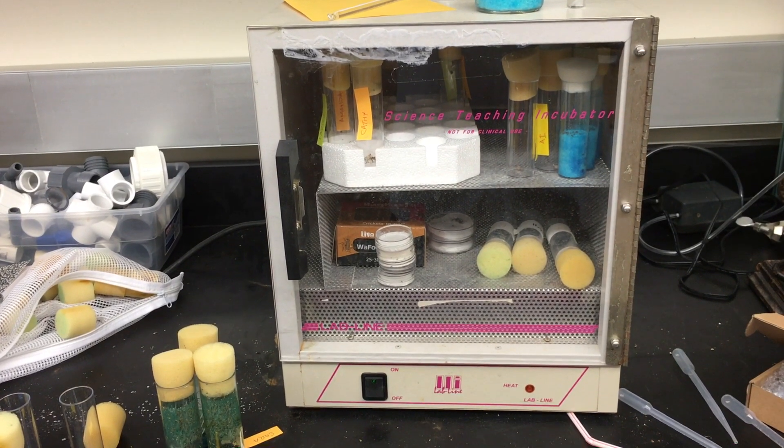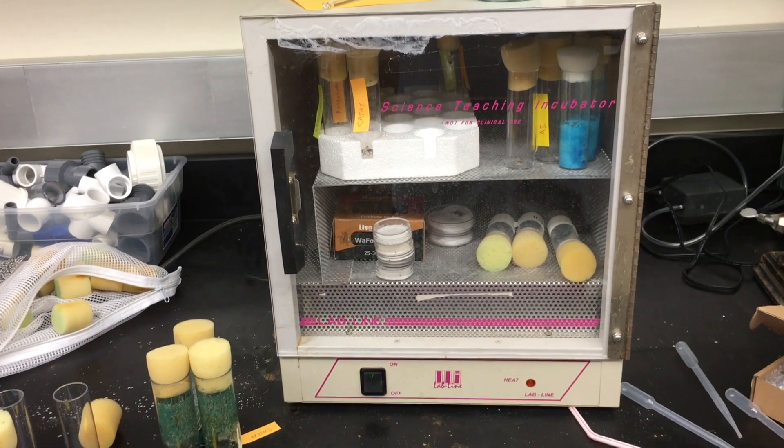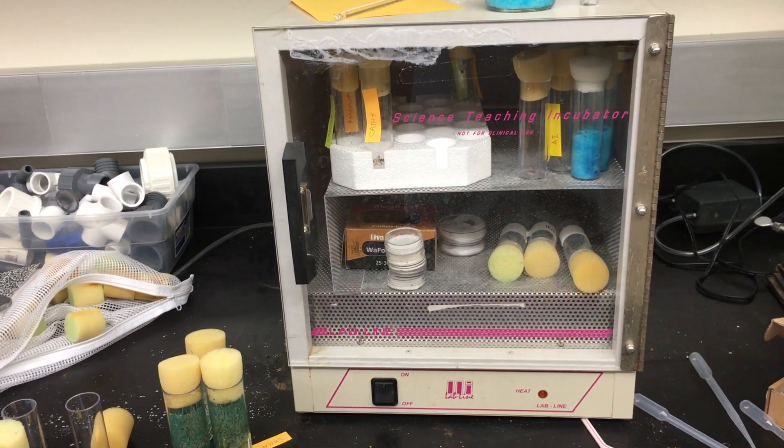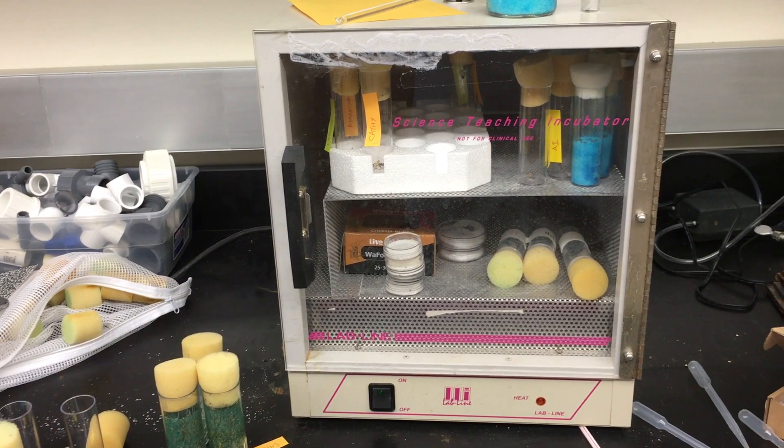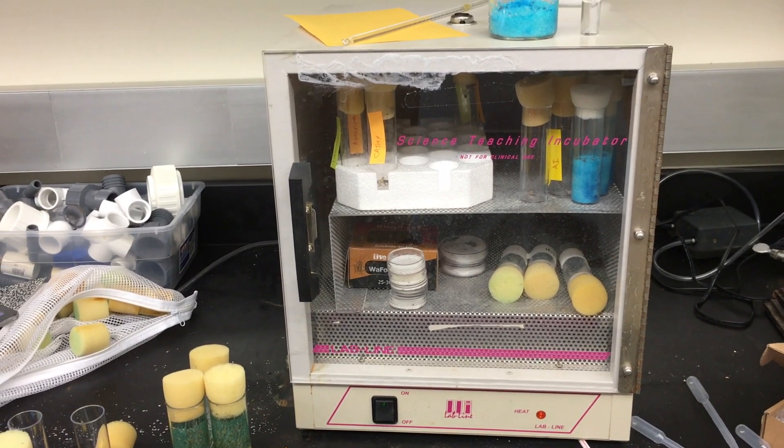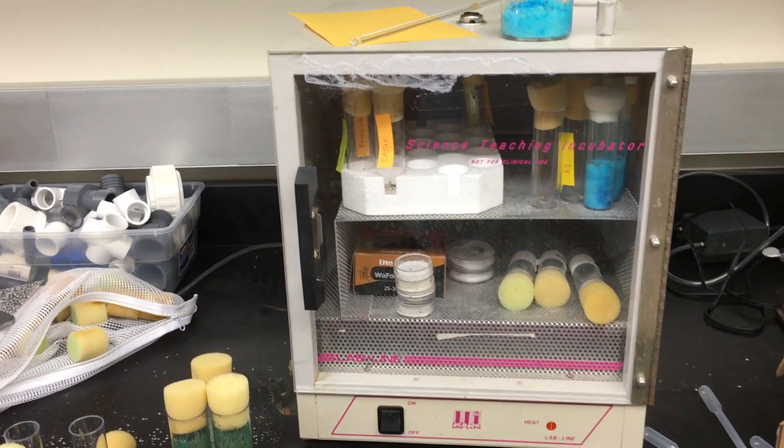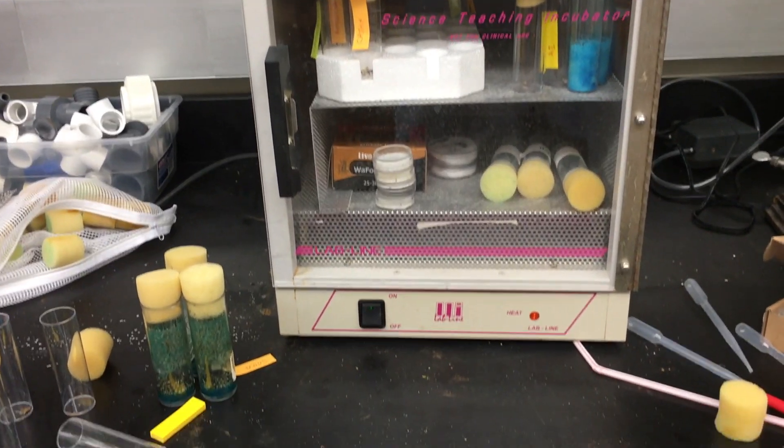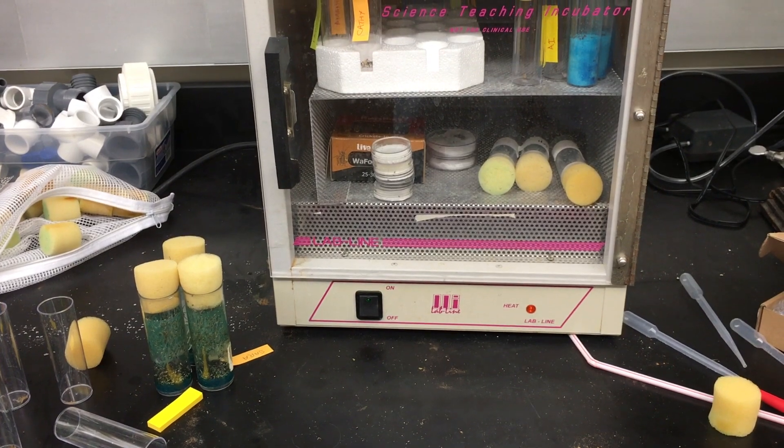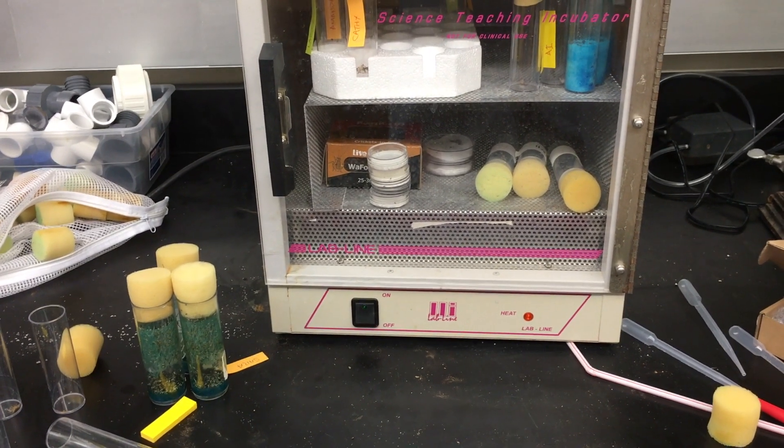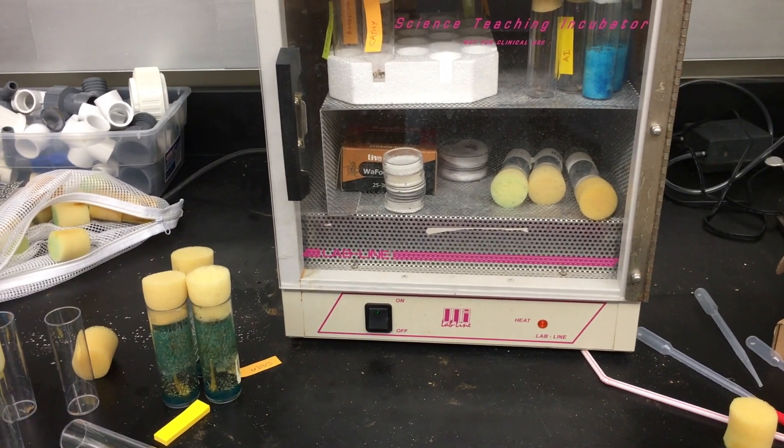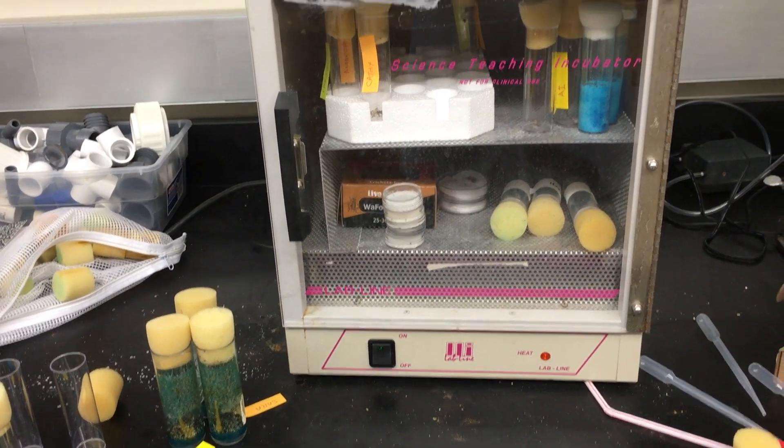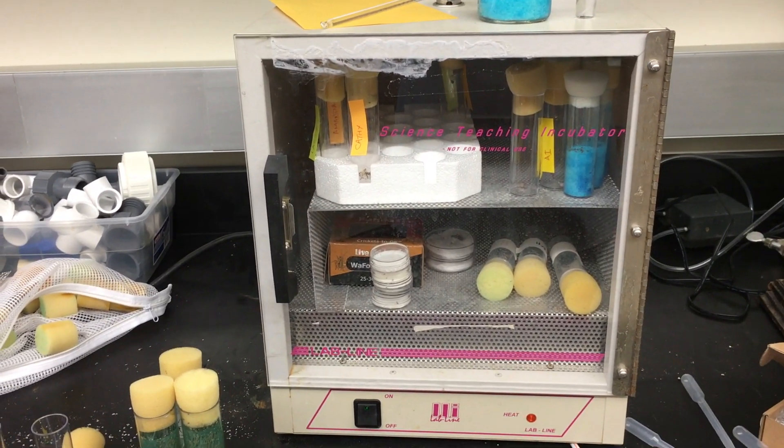And this is just my little incubator, right now set for 25 degrees Celsius. What you can see in there is a bunch of tubes - those are the spider tubes. I've also got some fruit fly media, I'm growing those wingless fruit flies. You can see a few of them down there to the left. These are just simple plastic tubes with foam rubber plugs, and everything is growing away in there.